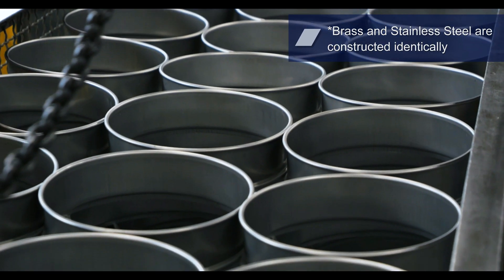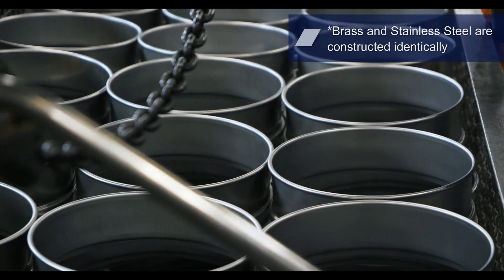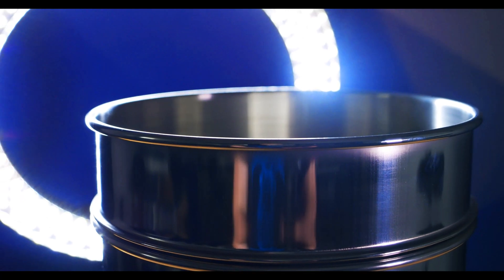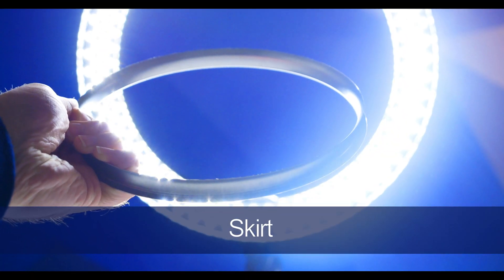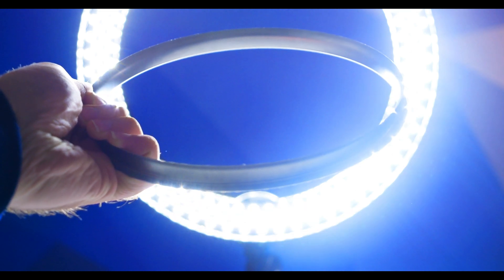Typically, testives come in a standard size of 3 inches, 8 inches, or 12 inches in the U.S., and 100 millimeters, 200 millimeters, or 300 millimeters internationally. The skirt provides support to stacked testives, preventing the stack from toppling over when conducting a testive analysis.